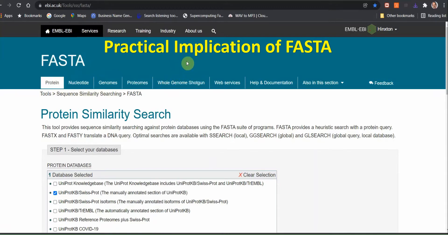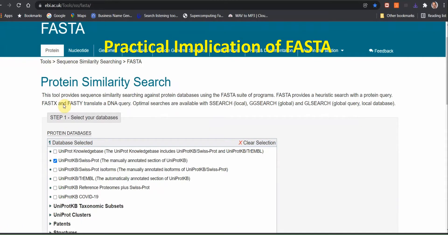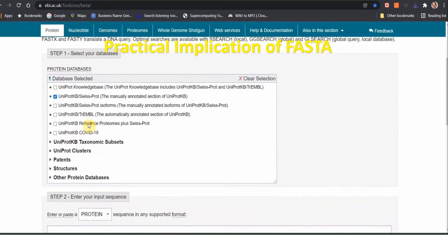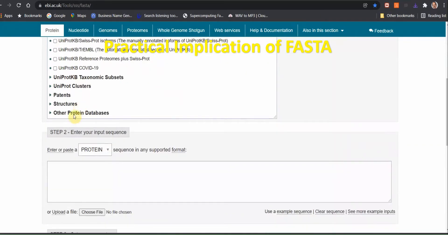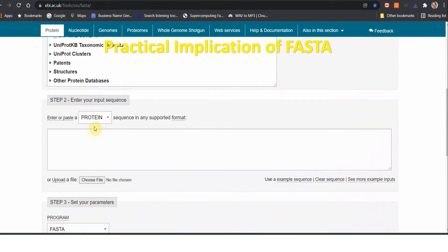We are interested in the protein. So just click on protein, and then you will see the protein similarity search. In this protein similarity search you can see step number 1: select your database. A lot of different type databases are available here. As per my view, it is better to initiate for beginners with the UniProt and SysProt database. Select this one, then you can see step number 2.